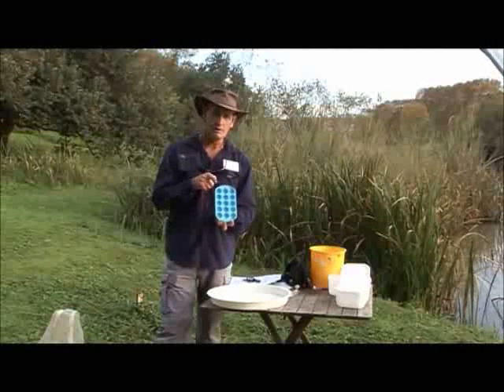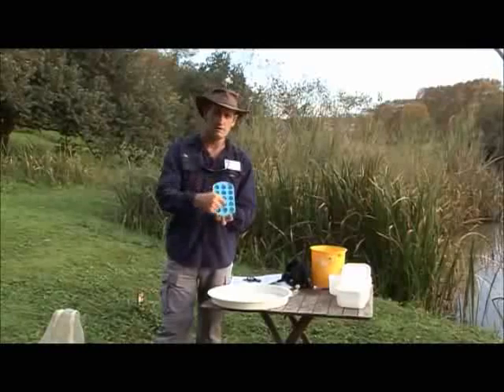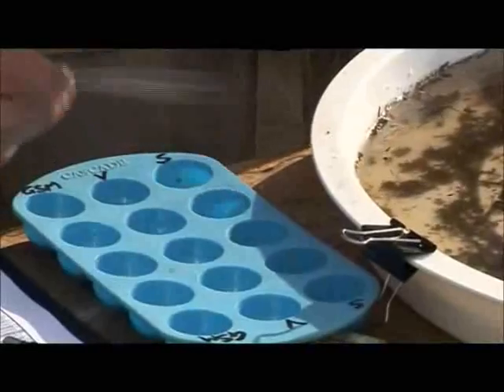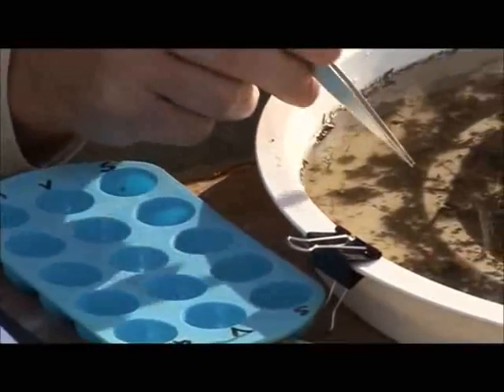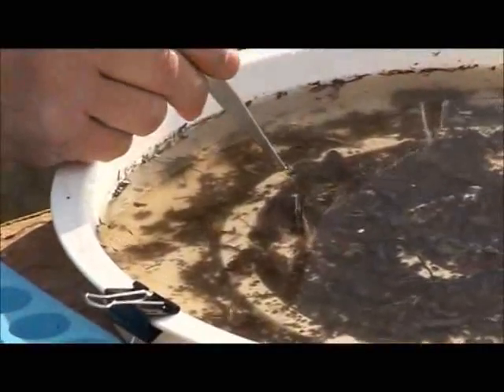So we have the ice cube tray labeled with the stones column, the vegetation column, and the gravel, sand and mud column, which allows us right at the end to look at the total number across the entire sample from our sample site.